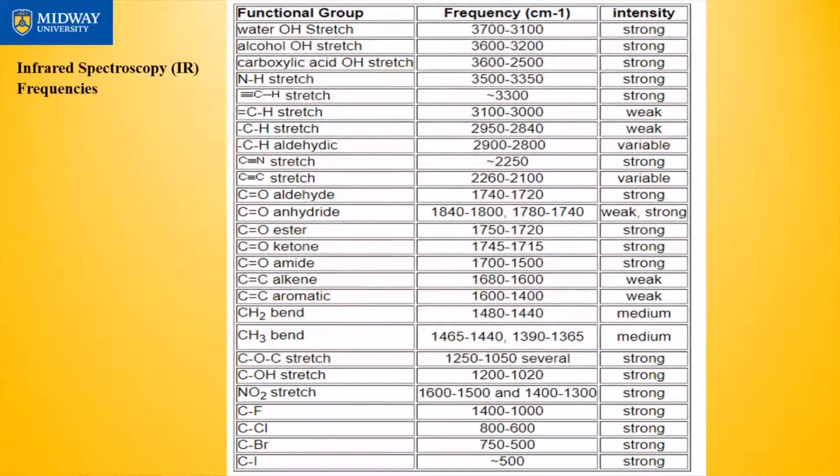All right. So these are the resonant frequencies I'm referring to. For instance, say we have this triple bond C-C. This happens only at this frequency. There may be another molecule or another functional group that could respond at this level, but for the purpose of the class, we are going to restrict to common things that we have studied for over 2 semesters, right? So these are the resonance frequencies I was referring to. That particular range of values is only for C triple bond C, right?